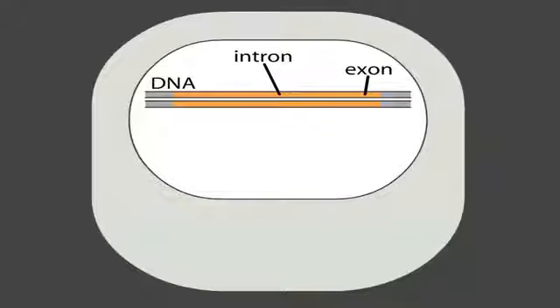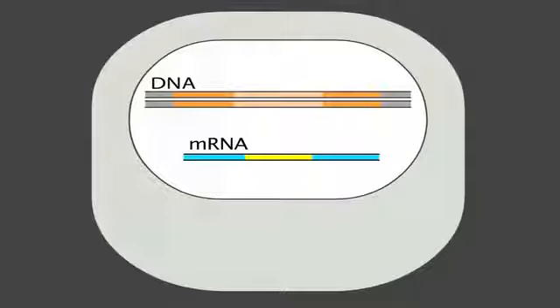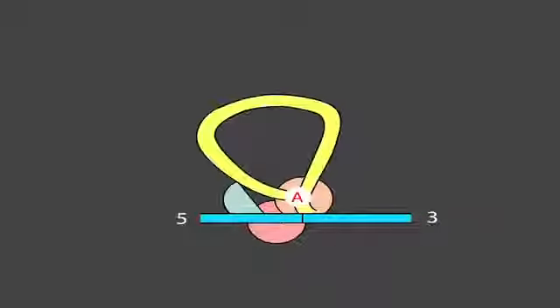To clone the DNA that we're interested in, in this case the insulin gene, obviously first we need to get some of its DNA. It'd be great if we could just get that from the cell. But because eukaryotic genes like insulin have introns, we can't just extract the DNA. Instead, we extract the cell's mRNA, which has already had the introns removed during transcription.